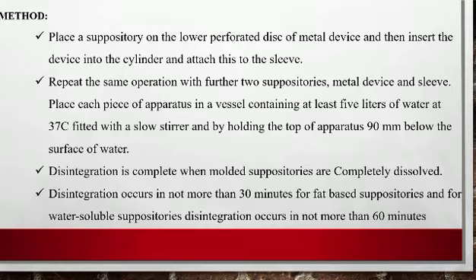The apparatus is placed 90 millimeter from the top, and below that the vessel contains 5 liters of water at 37 degrees Celsius with a slow stirrer.